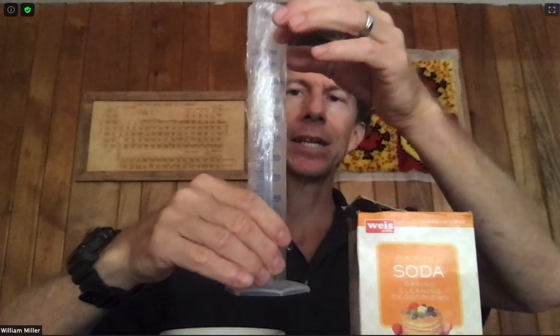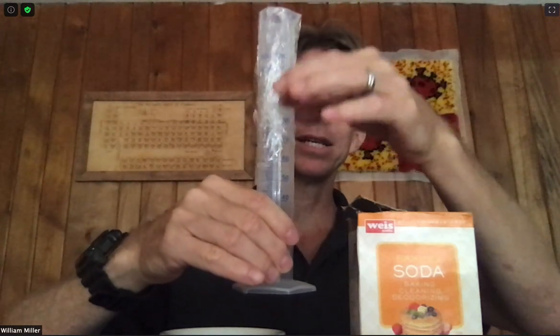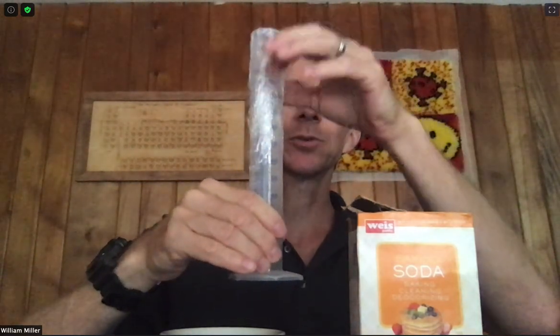You'll also need a 100 milliliter graduated cylinder. Mine is already in its final state for this lab, filled to 100 milliliters and covered with plastic to create a solution of sodium carbonate that we'll use in next week's lab. And those are all the materials you need for this lab.